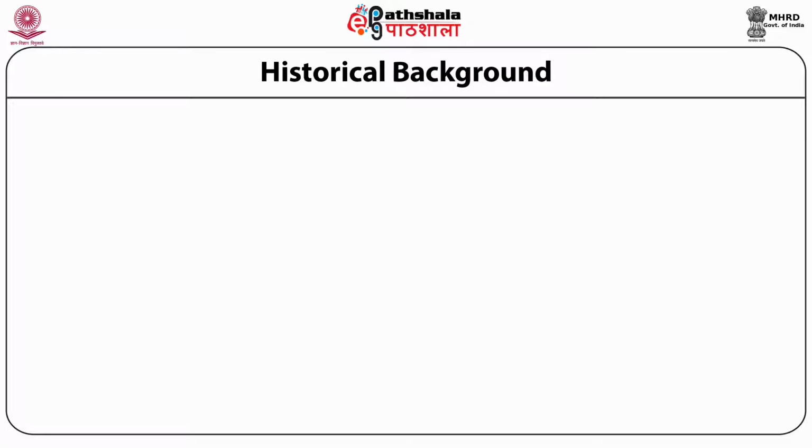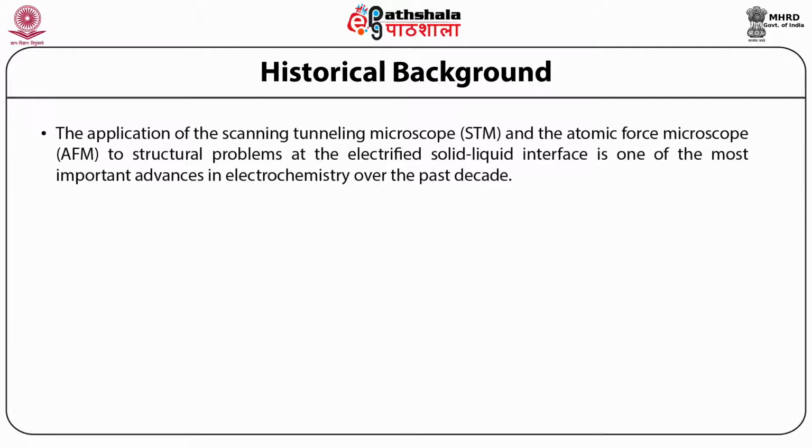Historical background of this technique is given. The application of the scanning tunneling microscope, appropriately abbreviated as STM, and the atomic force microscope, which is rightly abbreviated as AFM, to structural problems at the electrified solid-liquid interface is one of the most important advances in electrochemistry over the past decade.